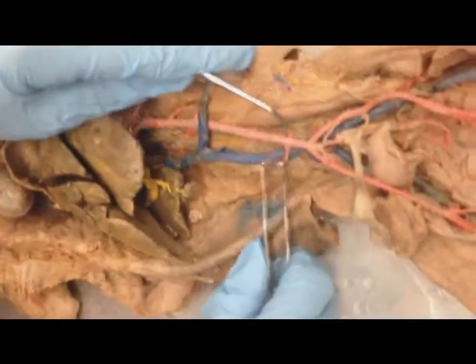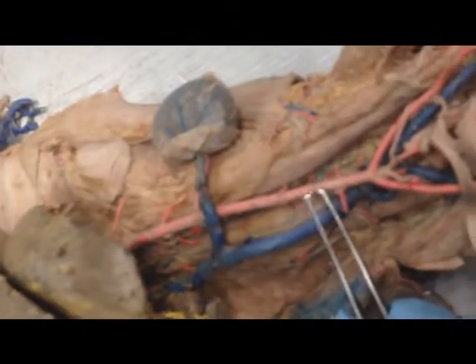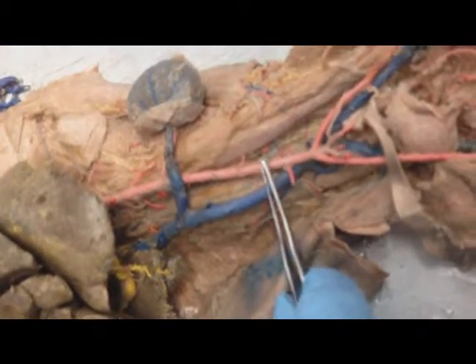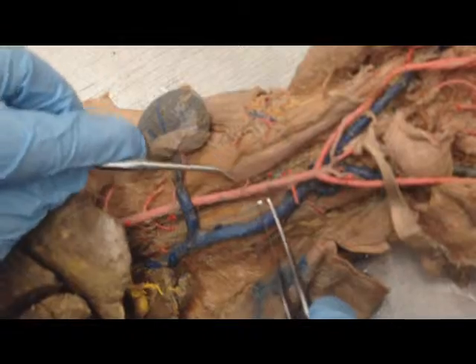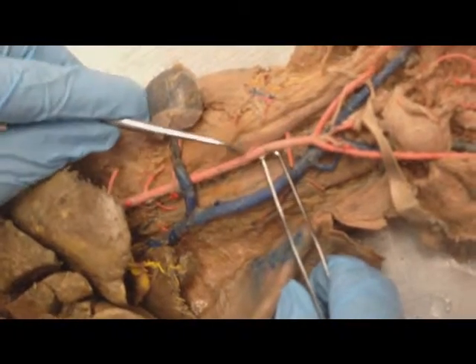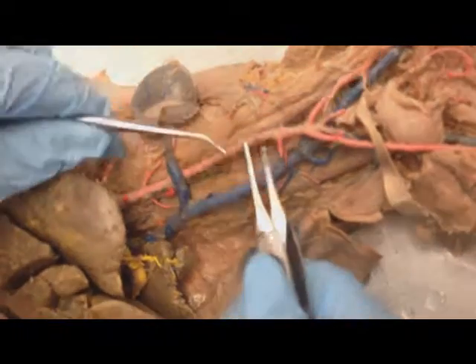Further up, this cat's a little mangled, but if you go from the iliolumbars, usually the first one up is going to be called your inferior mesenteric. There are two mesenterics, so do not get them mixed up. This will be the inferior mesenteric. Above that, we have another pair of thin arteries. This one's missing its pair. They are the gonadals.